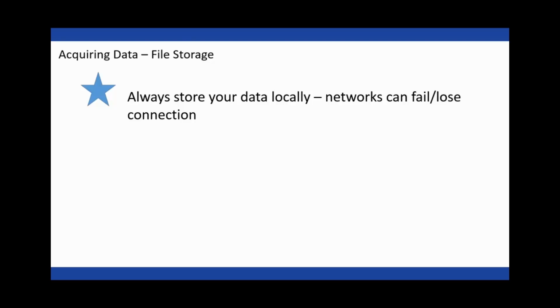And in the event that those connections fail during the middle of data acquisition, it's possible that your file could become corrupted and your data could be lost. So it's always better to store your data locally and then transfer to those file storage locations after the fact.